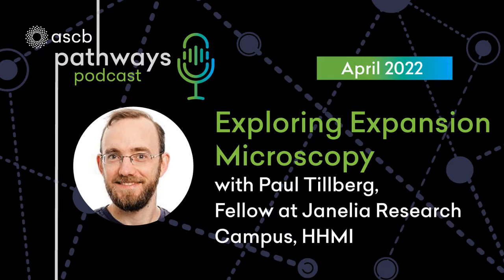So that would be a way of getting around the challenge, which is that tissue is very heterogeneous. So it's very hard to imagine taking something so heterogeneous and expanding it in a way that's uniform. So that was the insight, that you could use this engineered material followed by digestion or dissolution of the tissue to drive uniform expansion.